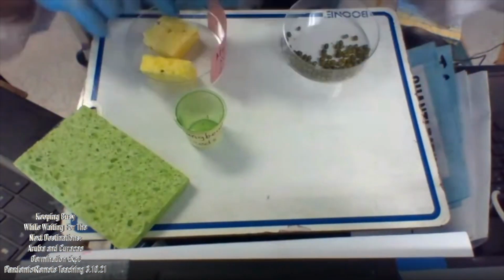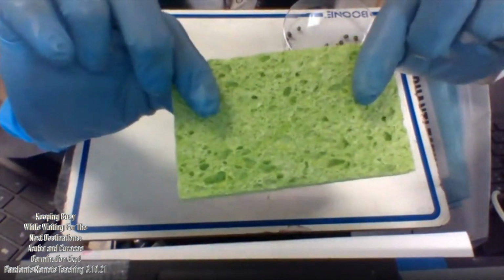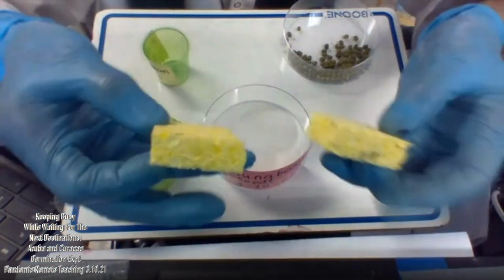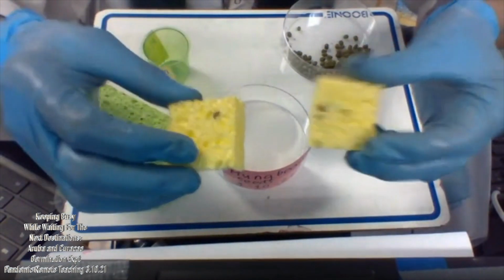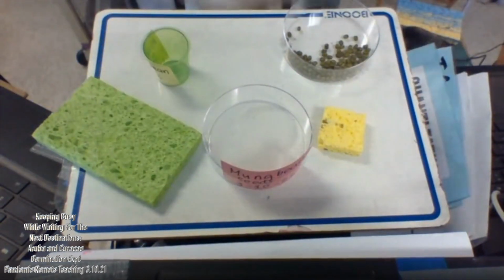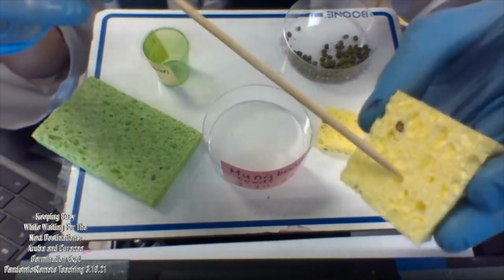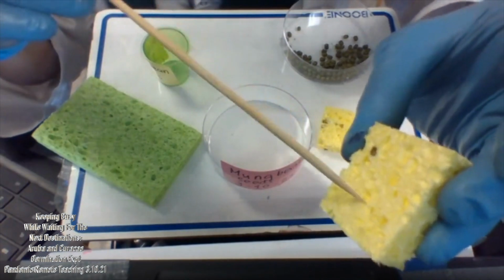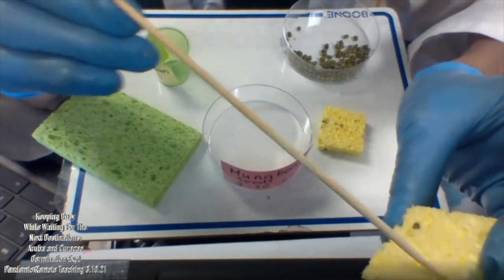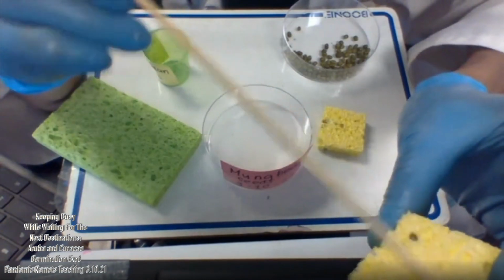So what you need to have is one sponge. You only need a small one. You need to cut the sponge into maybe two pieces, and the sponge does have small holes. All right, can you see this hole? Type in the chat. Can you see this hole? Oh, yeah, I need three holes. One, two, three. This will be the house of the seed because I want to put three seeds here.